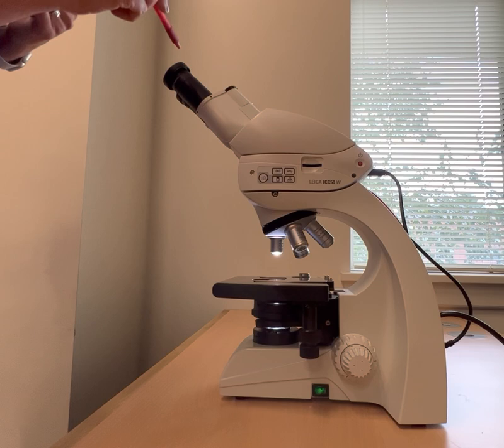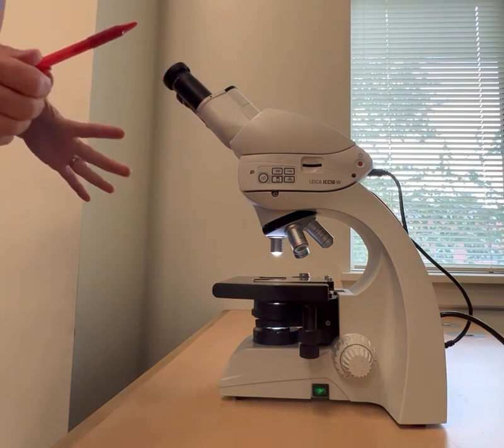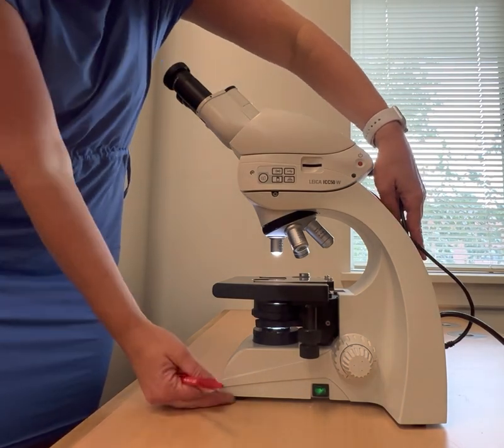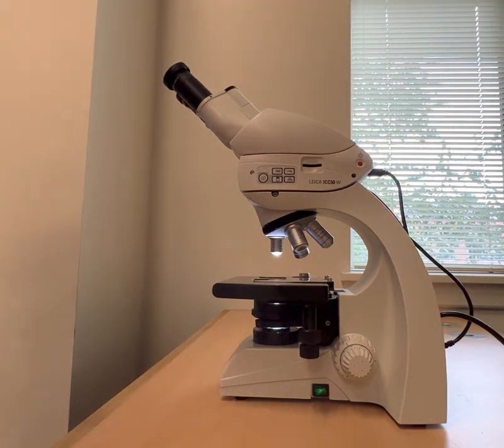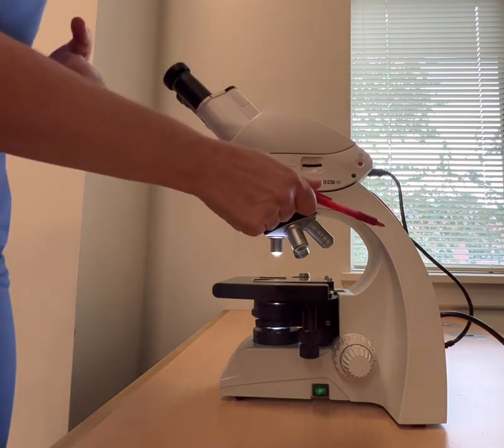So we have two oculars, the body tube. Then if you needed to move your microscope around, I always suggest two hands. So one on the arm, there's the arm right here, and one on the base down there. So you can safely transport your microscope around the lab room. So we got the oculars, we got our tube, we have our arm.